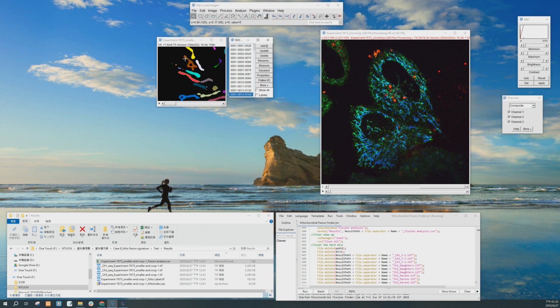Its identification method is actually matching the contour from the current time point to the contour at the next time point, so that it becomes obvious that at the previous time point, the so-called mother mitochondria was just a single, distinct structure. But at the next time point, you'll see it marked in 2 different colors, with these 2 different colors indicating that it has actually divided.